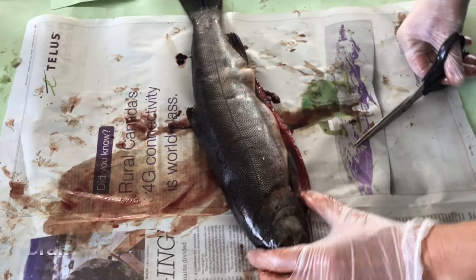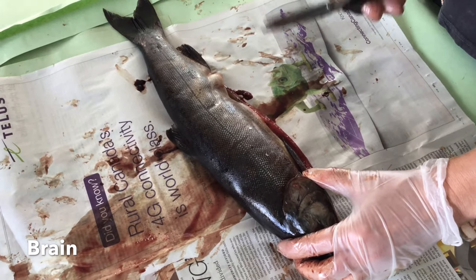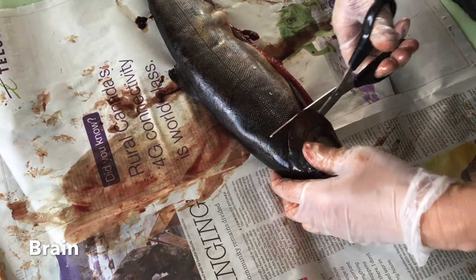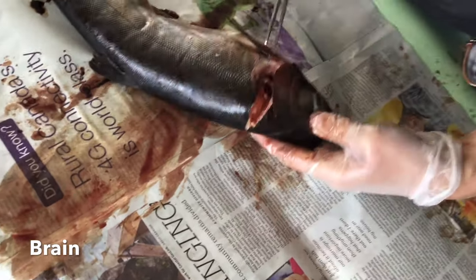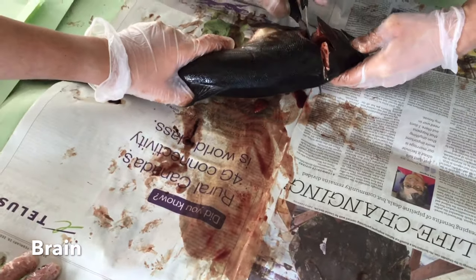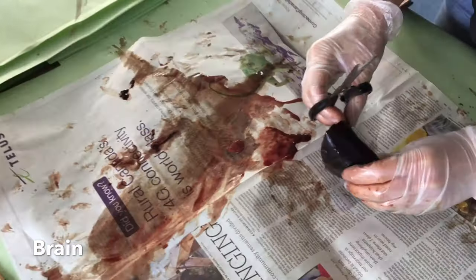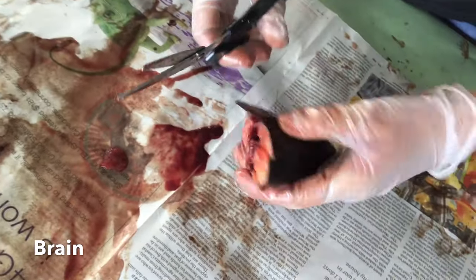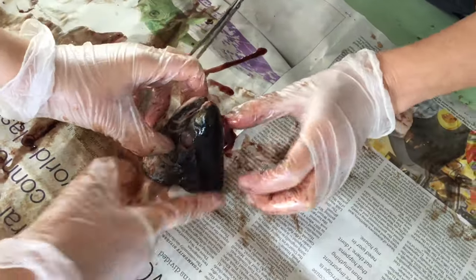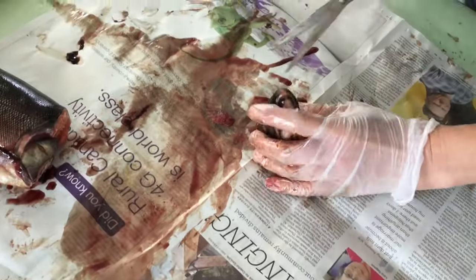Now we are going to look at the brain. And Miss Anima is going to remove, well, decapitate it. No other way of putting it. We're going to take the head off, and then we are going to struggle because this is one of the hardest parts of the dissection. And you went in from the top, right? To get to the brain. I have sped this part in the video up because it takes quite a long time to actually get the brain out.